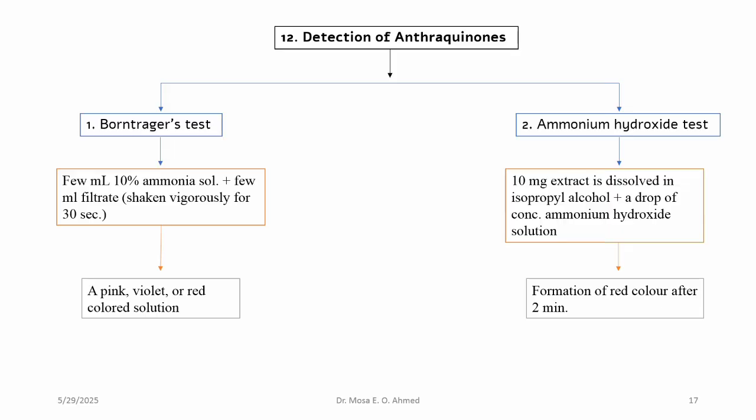Another test is the ammonium hydroxide solution test, which consists of a few drops of ammonium hydroxide solution added to 10 mg of plant extract dissolved in isopropyl alcohol. In case of presence of anthraquinone, formation of red color is observed after 2 minutes.